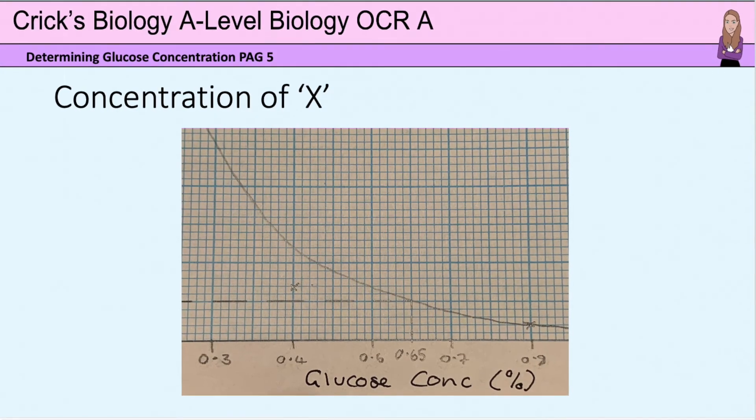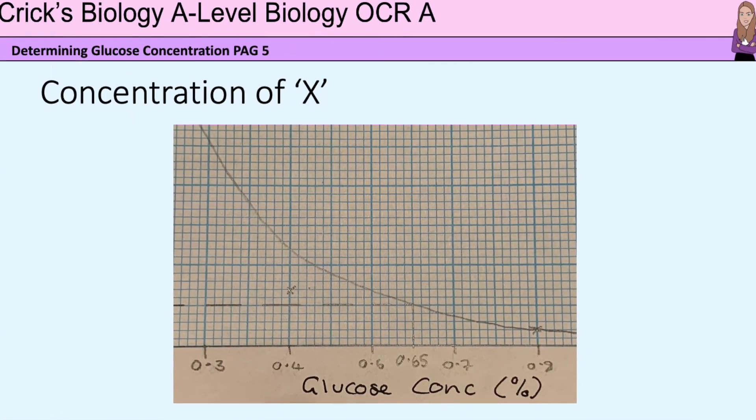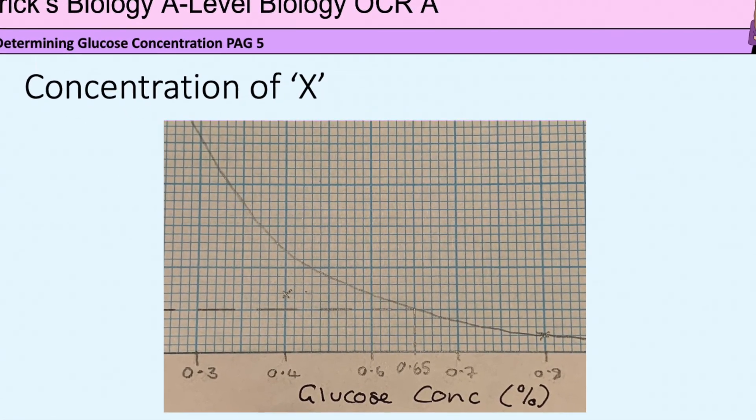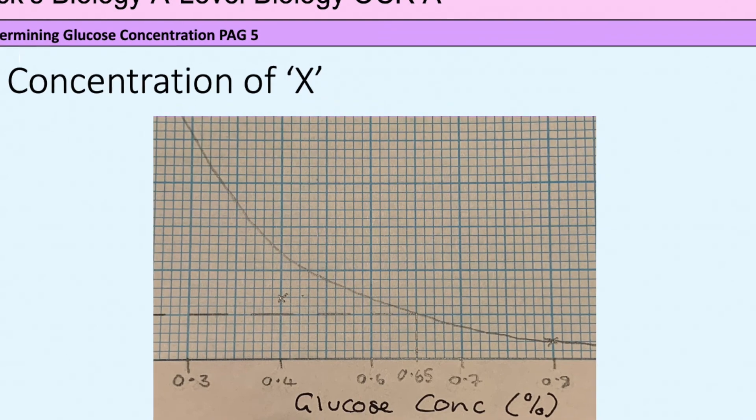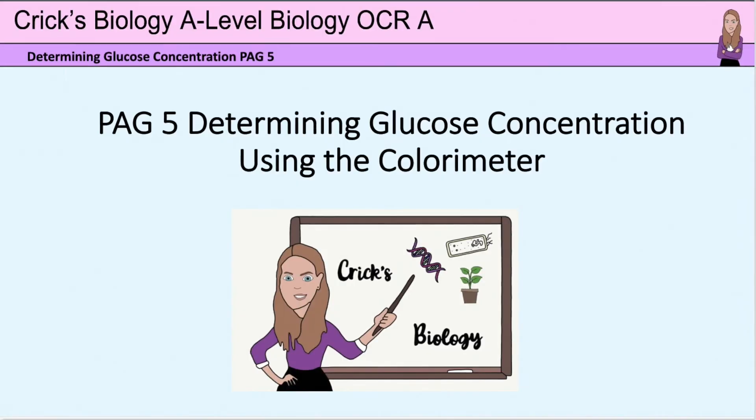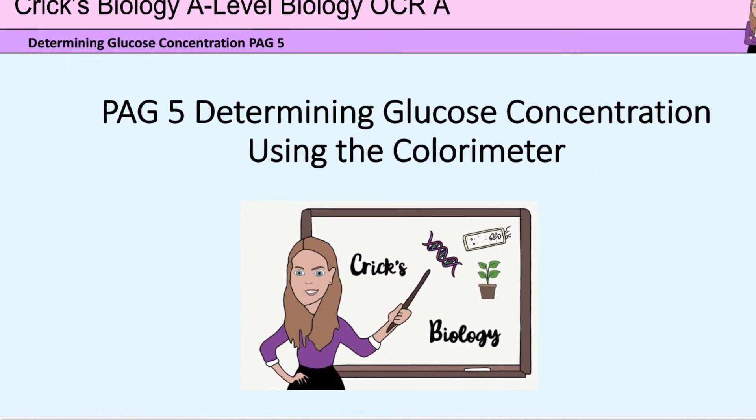And so you can see the final result for X is 0.65% glucose. So you have now learned how to do the quantitative test for reducing sugar using a colorimeter.